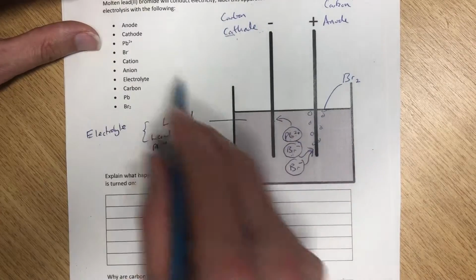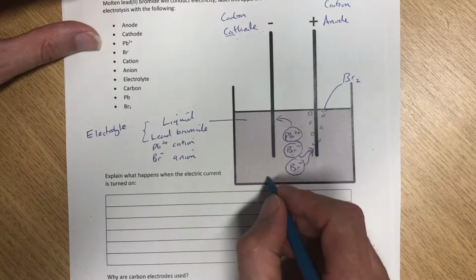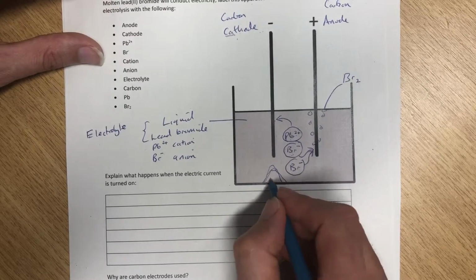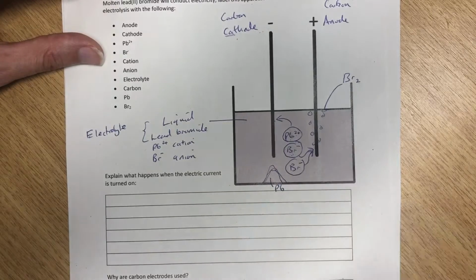Now this is very hot here, and lead, when it's a metal, is very dense. So what we would end up with is some pooling of lead down the bottom here, pure lead metal.